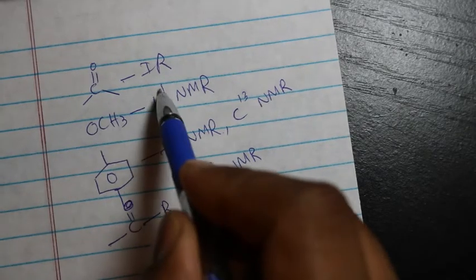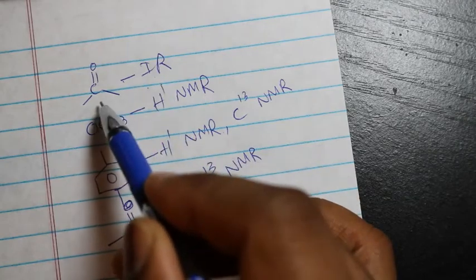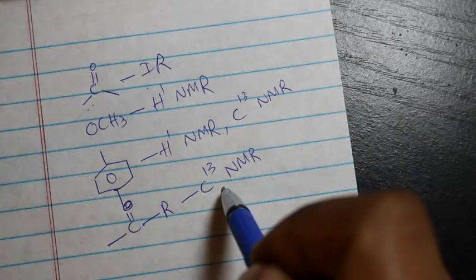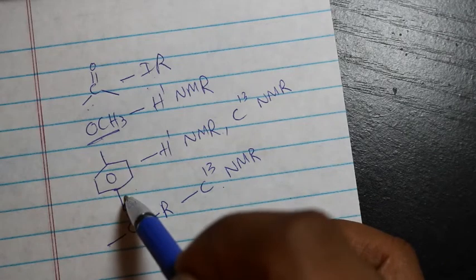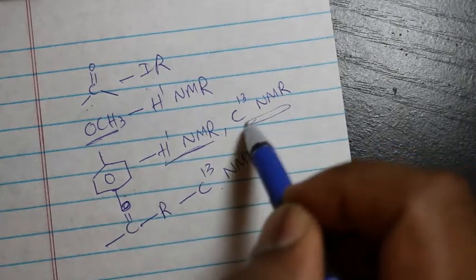So this is all the information we have so far. We have a carbonyl functional group we confirm from IR and C13 NMR, and we confirm a methoxy, and also we confirm a 1,4 disubstituted benzene ring from proton NMR and carbon NMR.